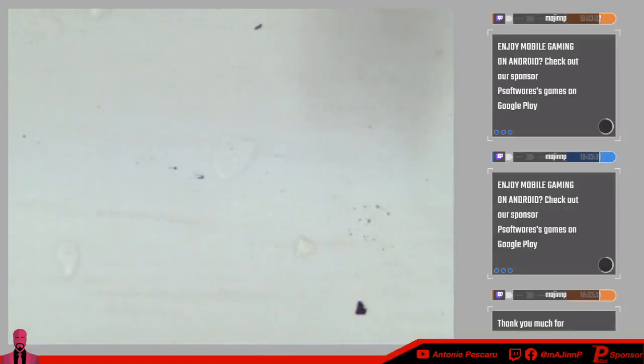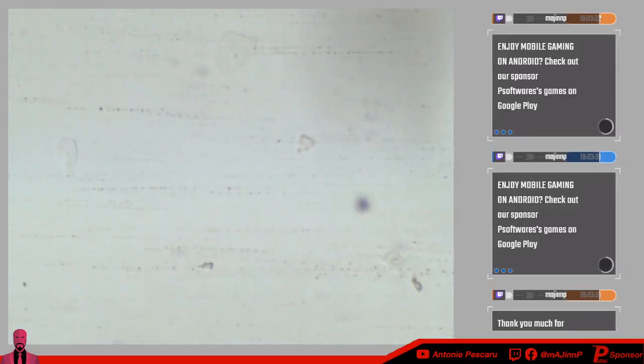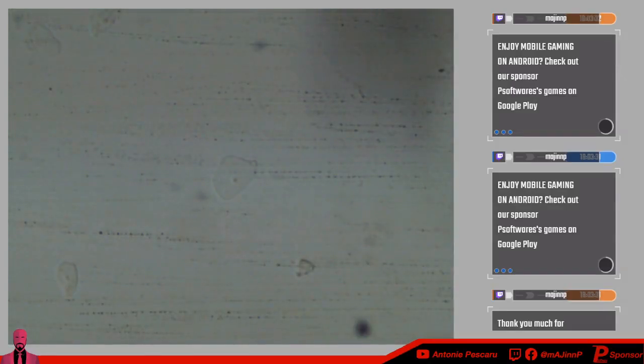Oh, is that one? I think I found one. Bingo. Bingo right there. And I think there's a few, like 2 more. There's one over here, and then one over here. Let me put the contrast real low.